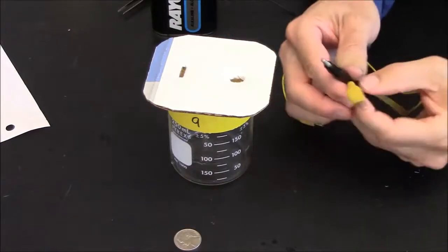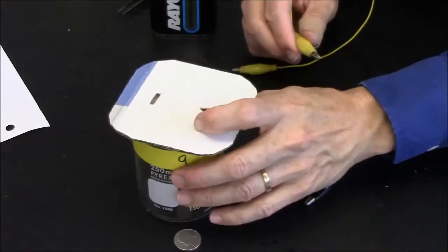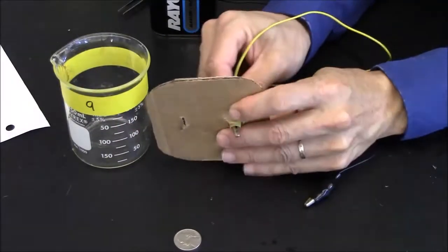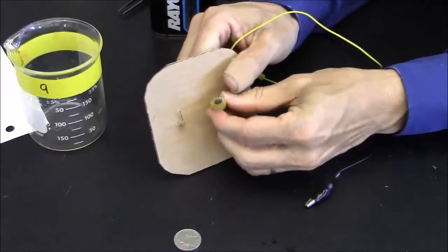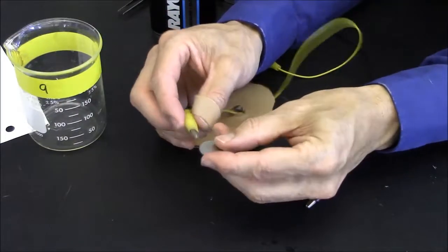You'll have 2 patch cords at your table, a dark one and a light one. The light one may be yellow or red or white. You'll want to push the light one through the lid. So this can take some doing. There. Okay, so this yellow cord has been passed through the lid, and I will clip my coin onto this yellow cord here.